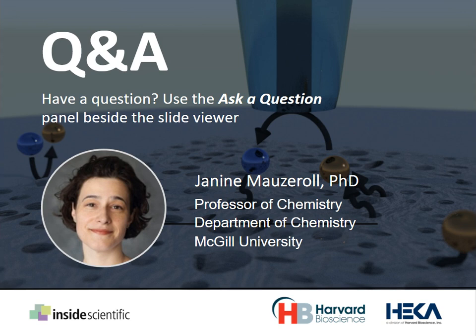You could do this and also change the solution if you wanted as well. That takes more time. So there's lots of strategies by which you can do this. And so it takes a little bit of experimental design at the beginning, asking yourself, what's the standard potential of the mediators? Will there be interference? So you do have to know a little bit about your substrate before you start imaging it.